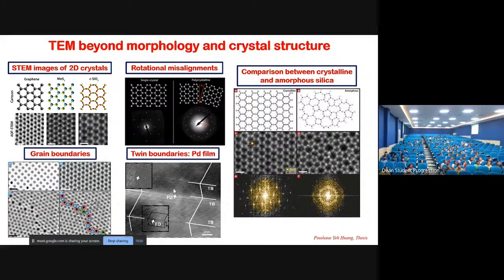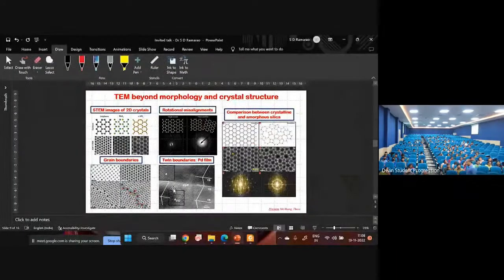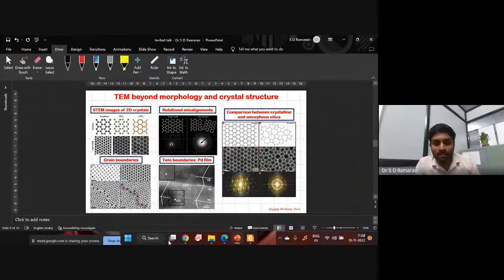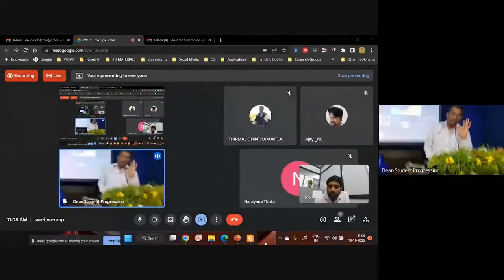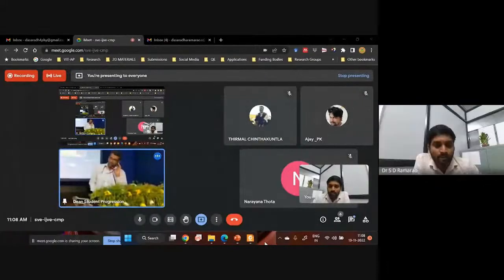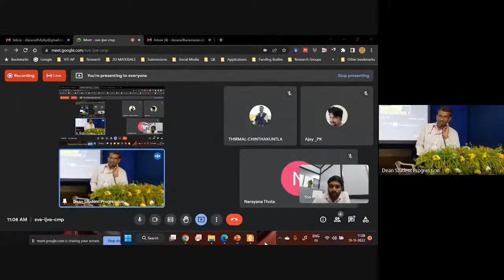Sir, I have a small doubt. As you mentioned the limitations and challenges of transmission electron microscopy, while we are studying thin materials, TEM studies would be much preferred compared to XRD.